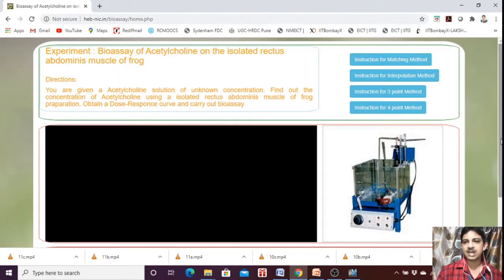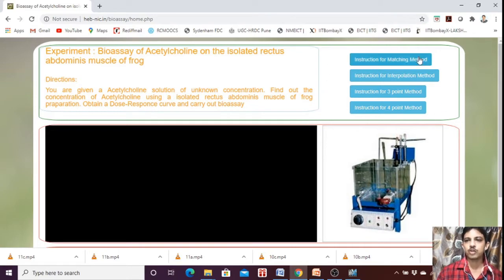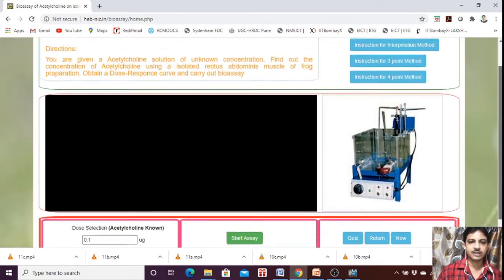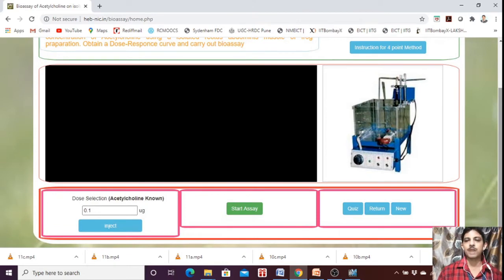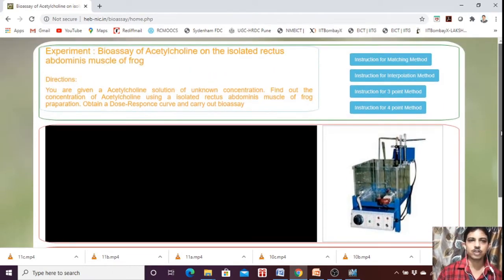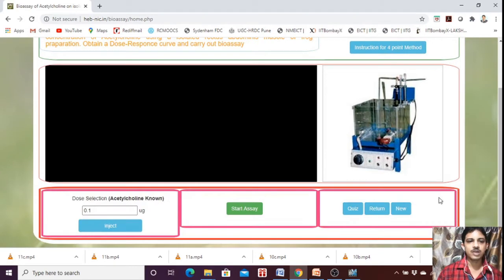Now this is the experiment. The instruction is for matching bioassay interpolation 3.4. Here you can find the dose of Acetylcholine — it is in micrograms.